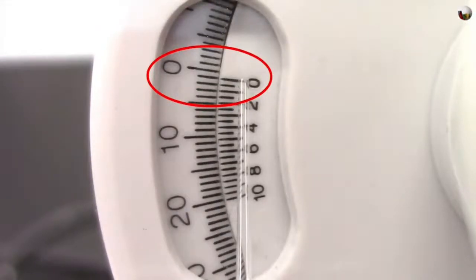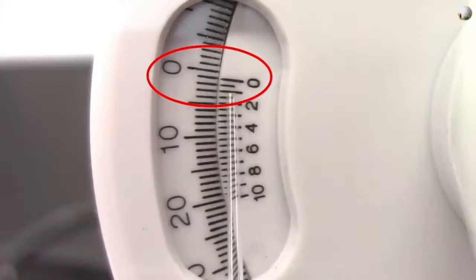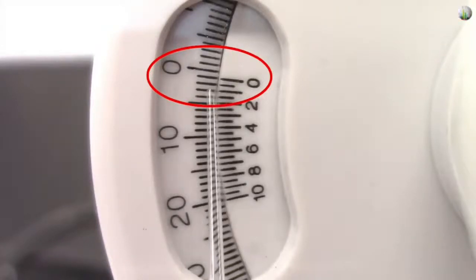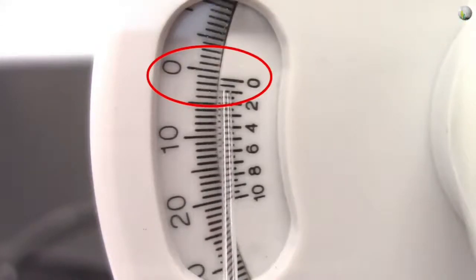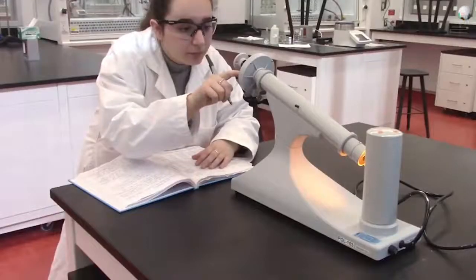To know the decimal point, look at the mark on the inner scale that exactly matches a mark of the outer scale. In this example, the decimal number is 1. So in this case, the reading is 1.1.